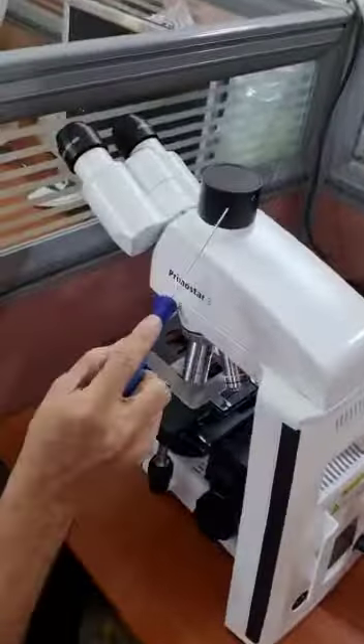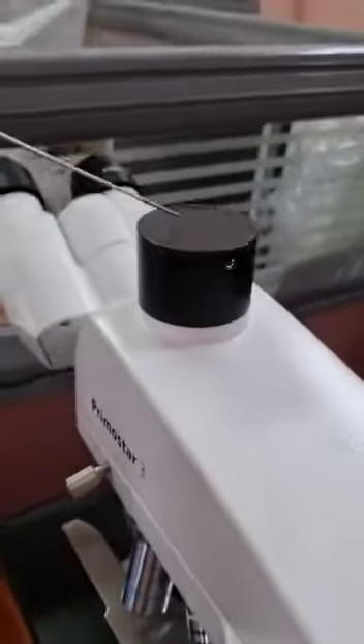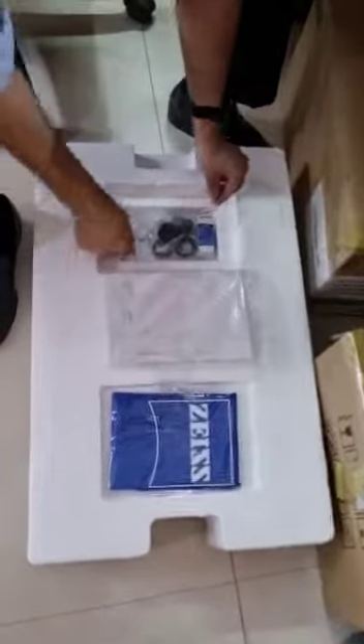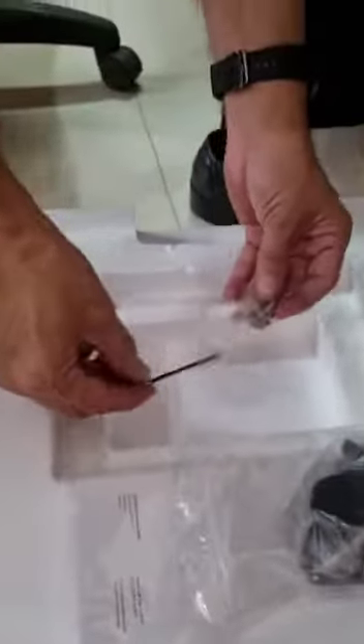To mount the camera onto the trinocular port, we first remove the Allen screw and take the dust cap out. To take this Allen screw out, go to the box of the Primostar 3 packing and take out the plastic pouch that comes along with the microscope.